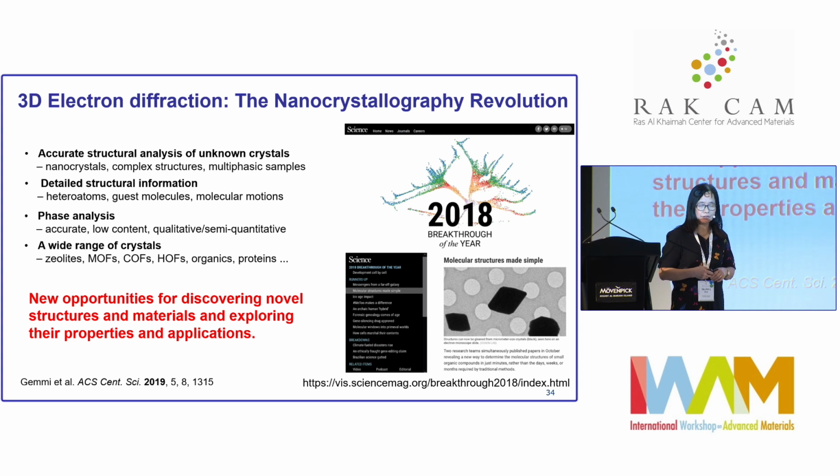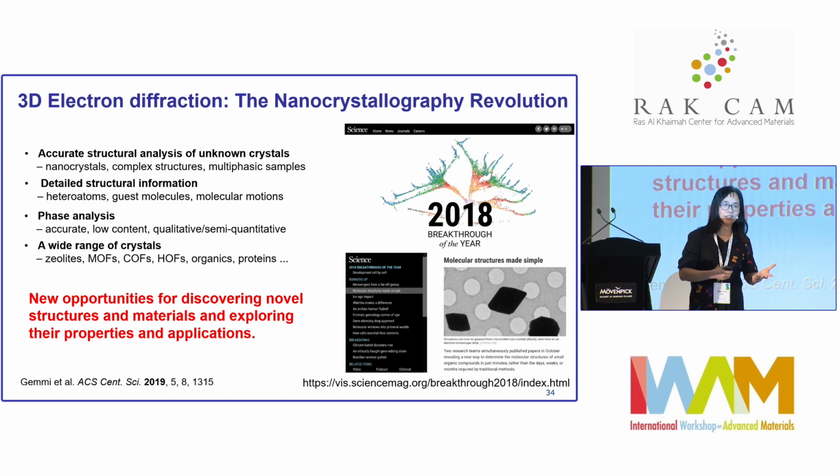And what I want you to think about, now that you have the technique, is that it works with very complicated samples. You can probably think about how you can modify your synthesis so you don't need to make new pure samples and larger crystals. You can think out of the box and design your synthesis so that you get a sample that can be studied using electron diffraction. So that will give you a lot of opportunities.